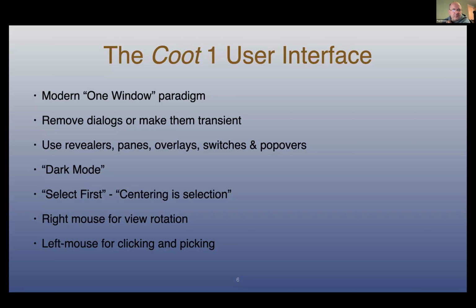Coot's graphics by default are black background, and that works well in dark mode. It should be possible with some little effort, but not no effort. The icons need to be modified to work with light mode, but light mode should be a possibility too.